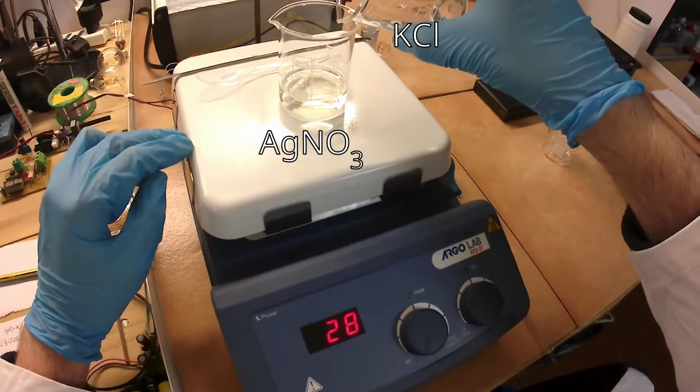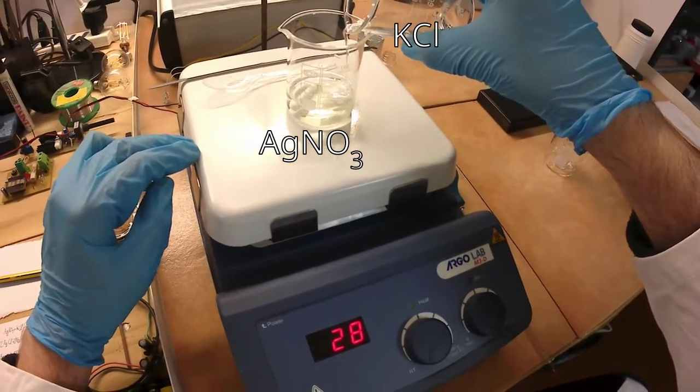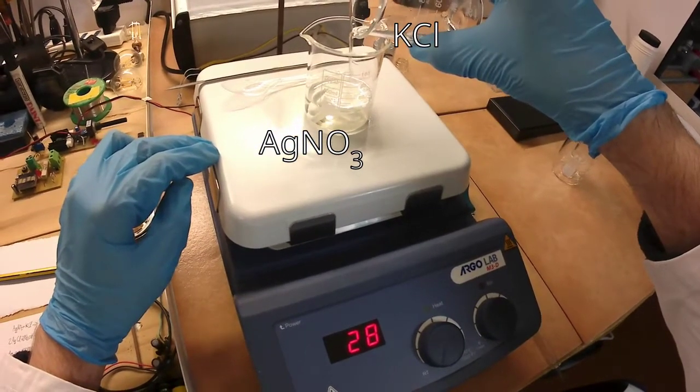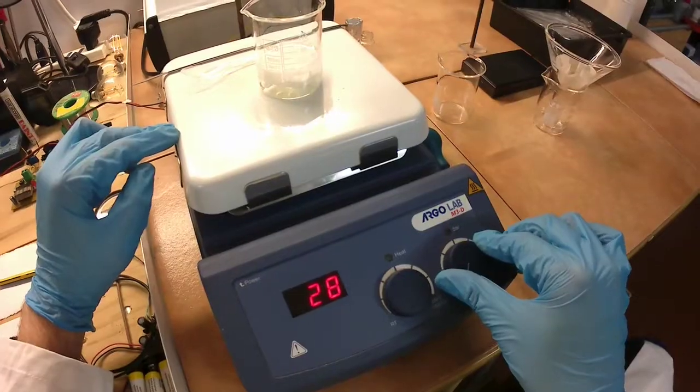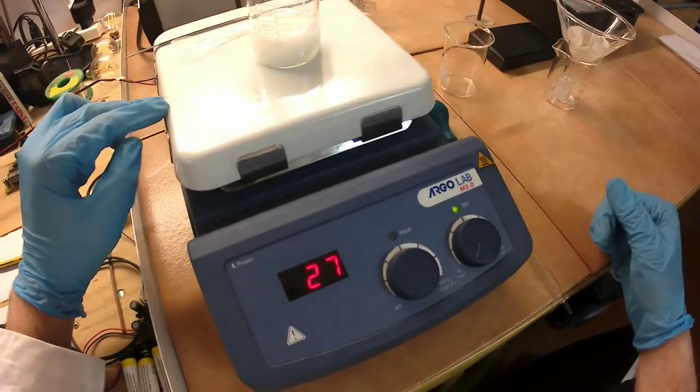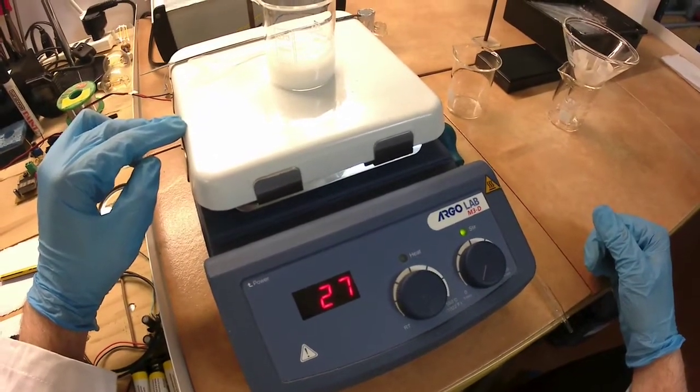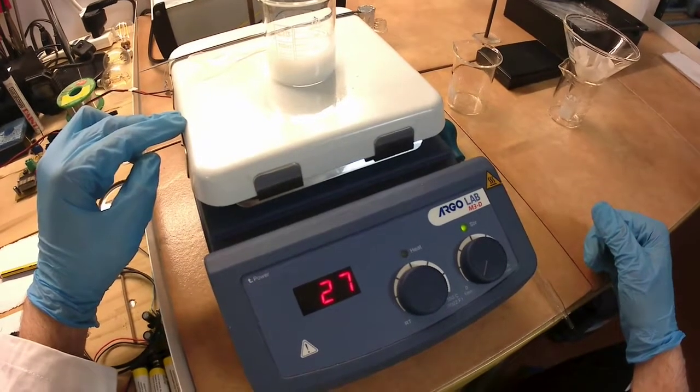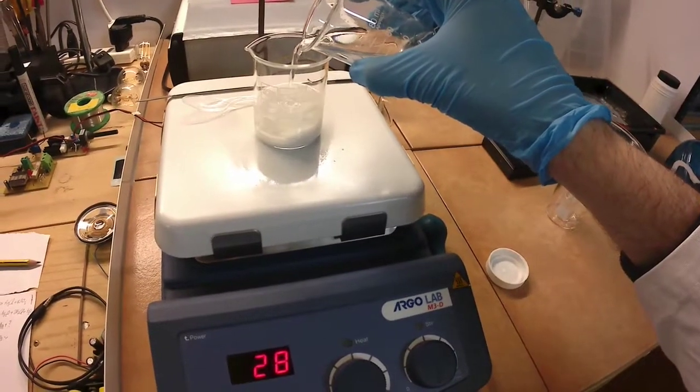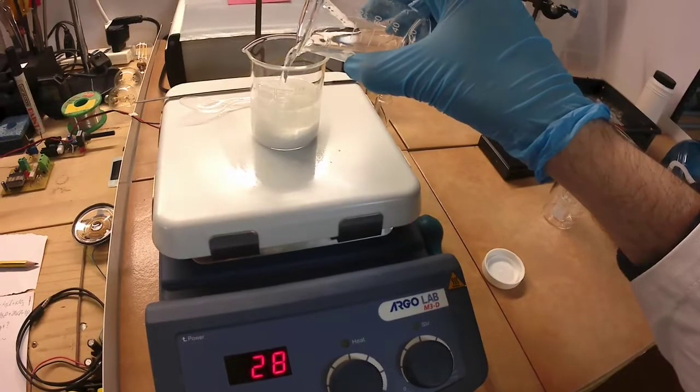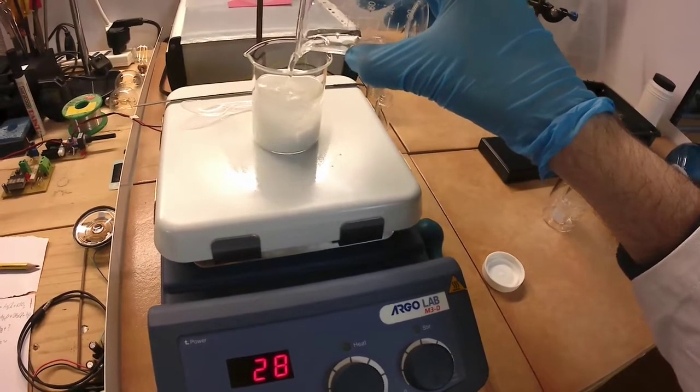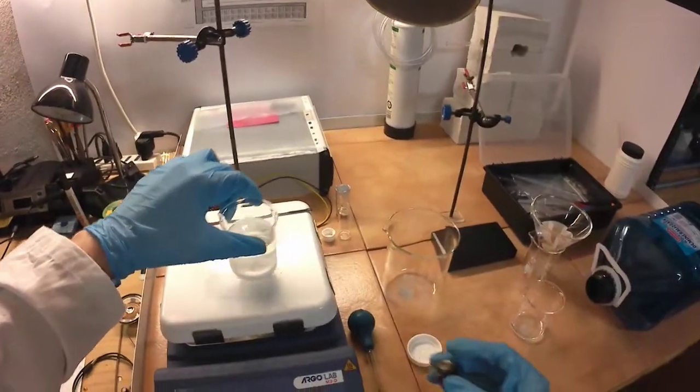Finally, it's time to precipitate the silver chloride. The precipitate needs to be decanted and washed with fresh deionized water several times. This is the step when we remove the impurities.